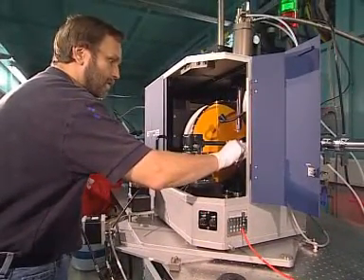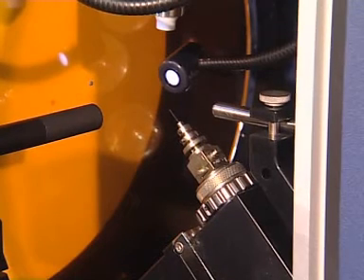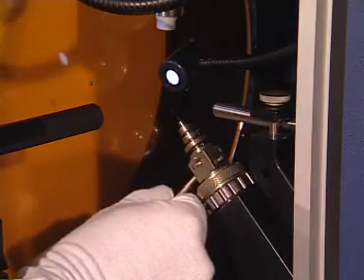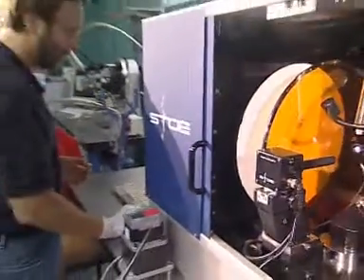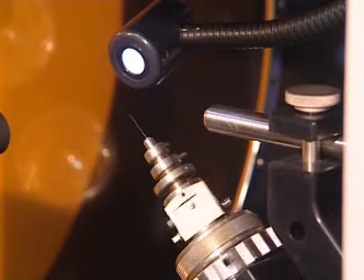To prepare the measurement, the crystallographer first mounts the crystal under a microscope onto the tip of a goniometer head and then places the head on the goniometer. Subsequently, the sample crystal is aligned with respect to its position relative to the beam by means of a microscope camera. To avoid radiation damage, the crystal is frozen and kept at a temperature not much above the boiling point of nitrogen by means of a cold gas flow.